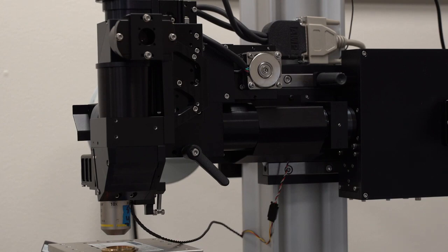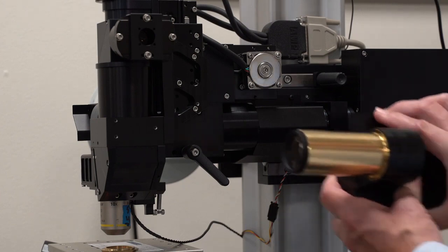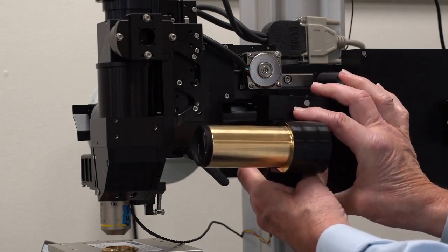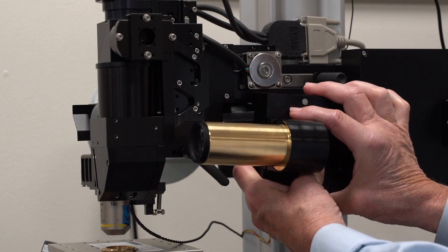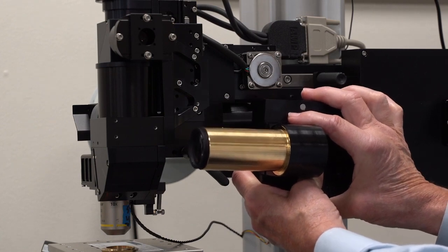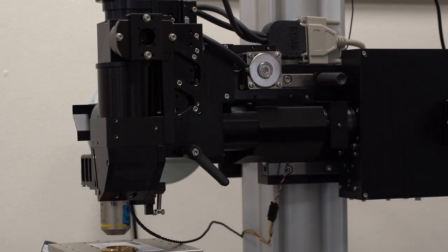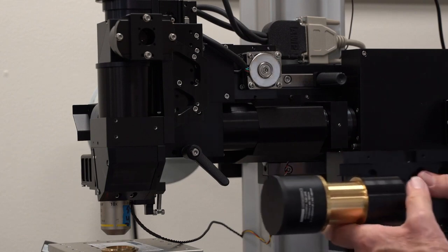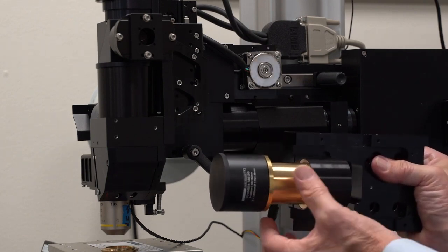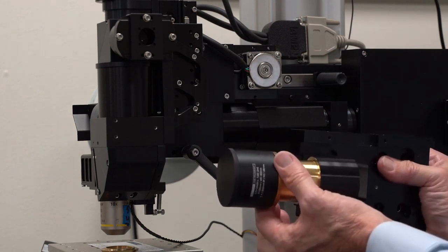To convert to 3-photon, the MOM core is somewhat modified to make space for a larger tube lens. This is the standard tube and tube lens that the XYZ head of the MOM rotates on the front of the scope. That tube is shortened and a mounting flange is added with the larger tube lens.